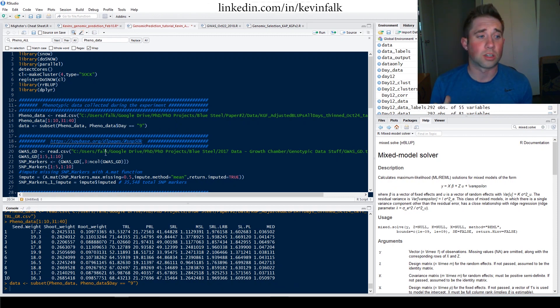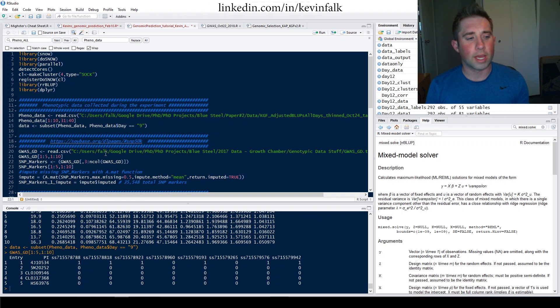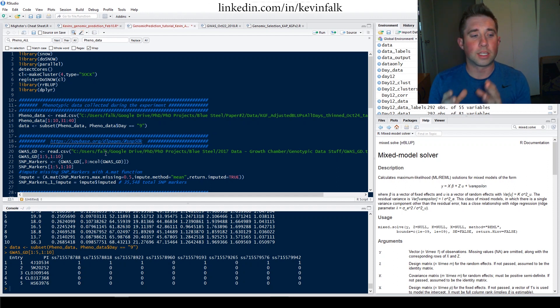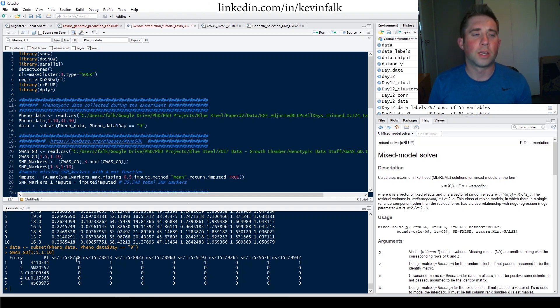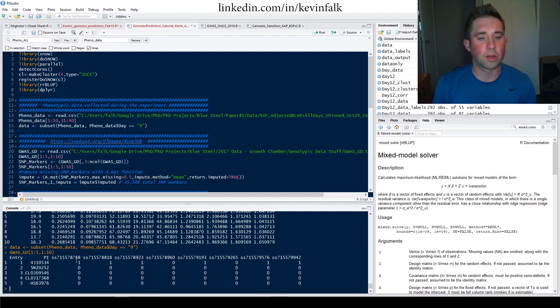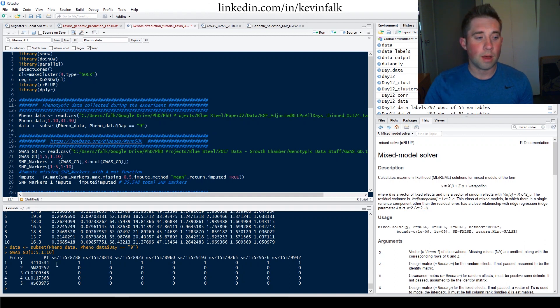It takes a while to read in because it's a large file, so I'm going to skip that step and just look at some of the SNP data. Here we have the entry number, the PI name, as well as the different SNPs — first SNP, second SNP, third SNP. The SNPs can be negative one, zero, or positive one, depending on whether they're the major allele, the minor allele, or heterozygous. I believe the major allele is zero and the minor allele is one, but don't quote me on that. So we have our genotypic data brought into the system.